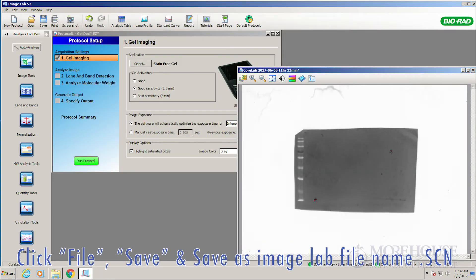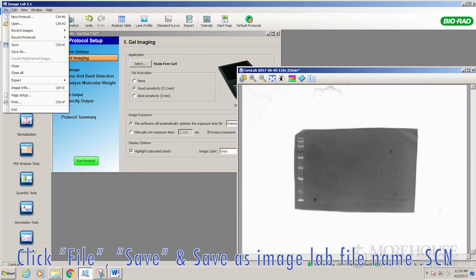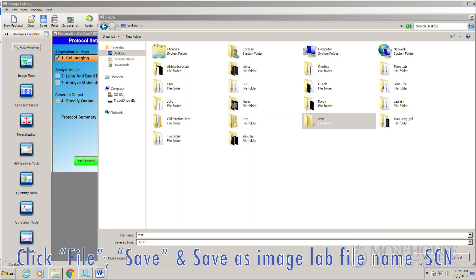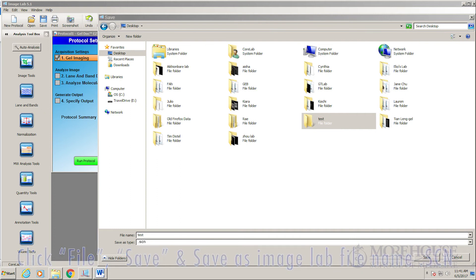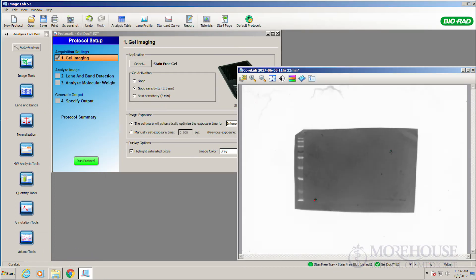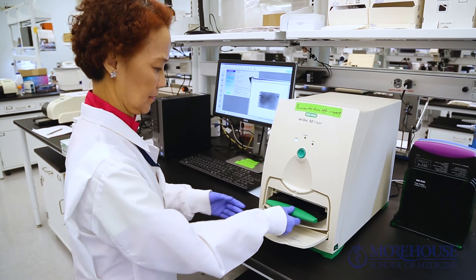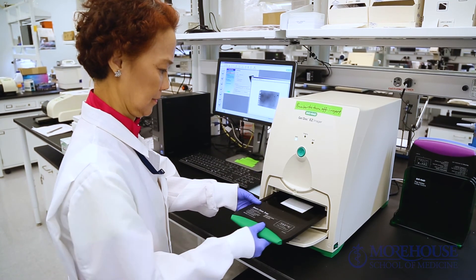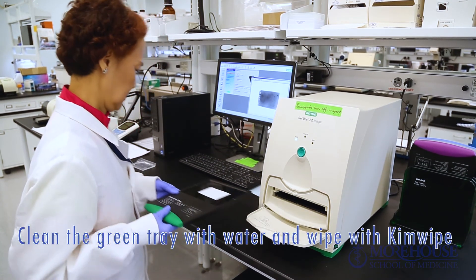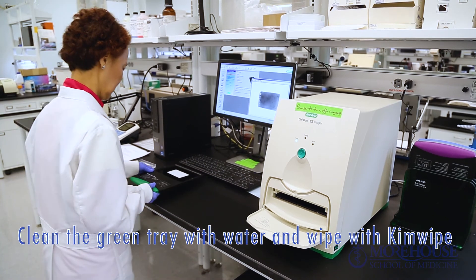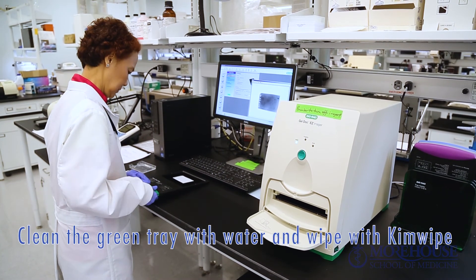Click file save. Original image lab file name .scn. Clean the green tray with water and wipe with Kimwipe.